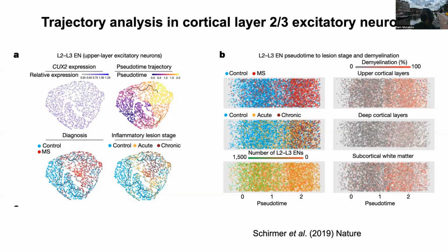The way they did it is kind of taking the 2D picture of the UMAP and compressing it into 1D. That's just the pseudotime, right? But then it's 2D again. They've lost their information. So it could have just been a KDE. Also, it's throwing me off that the number of L2, L3 units goes from 1500 to 0. Oh yeah. But this paper is a good one to nitpick if you want to read their whole data thing.